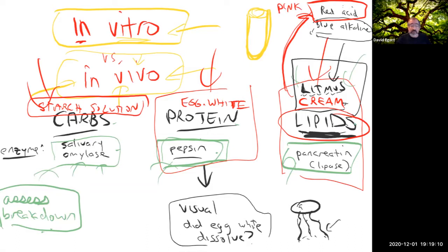So that's going to be my way to assess the breakdown of fats. If it stays blue, the fats aren't breaking down. If it's turning pink, that means the fats are breaking down into fatty acids.